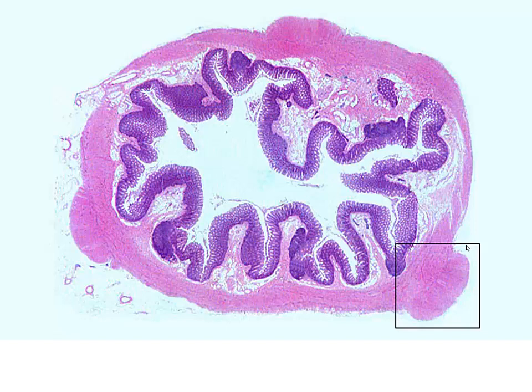So we have a low-magnification shot, again, looking at the colon. Mostly what we see, all this white, that's going to be our crypts of Lieberkühn, and we have that white appearance because of all the goblet cells present. Muscularis mucosa is in here somewhere, we don't really see it. Lamina propria. Submucosa, for all intents and purposes, is going to be fairly thin in most places, but then we get to our muscularis externa, and these knobs that we see are our cross sections of our taenia coli. So those knobs are the indicative histological feature that we look for to help us identify, even in this low magnification view, and be fairly confident we're looking at colon.